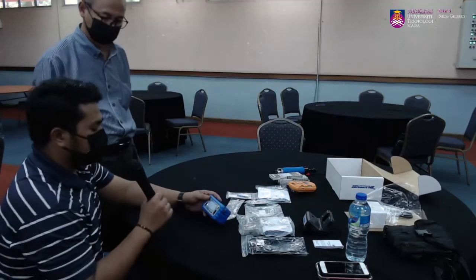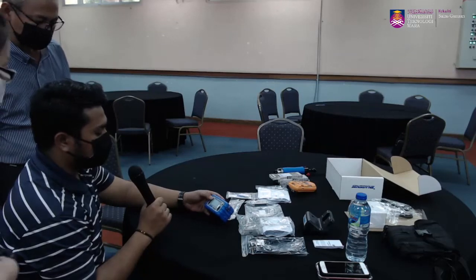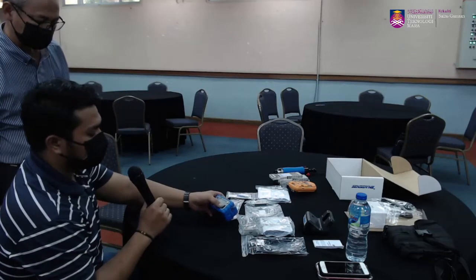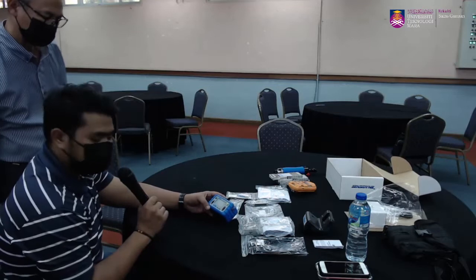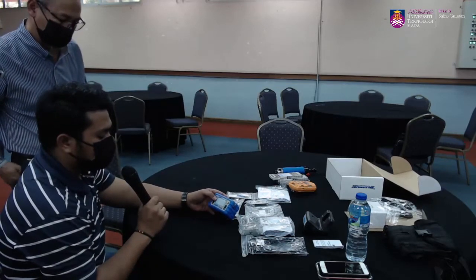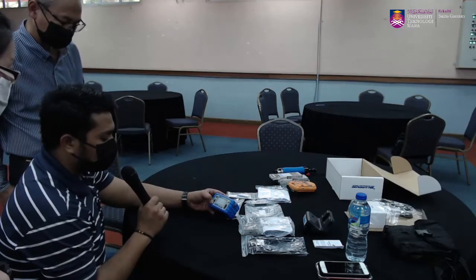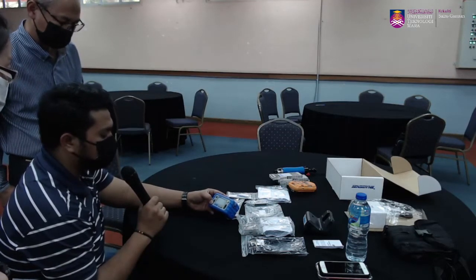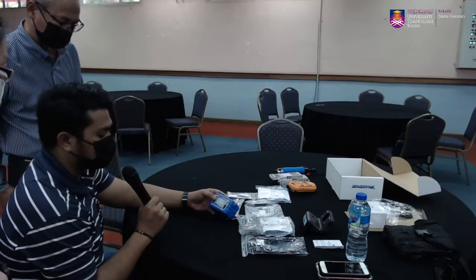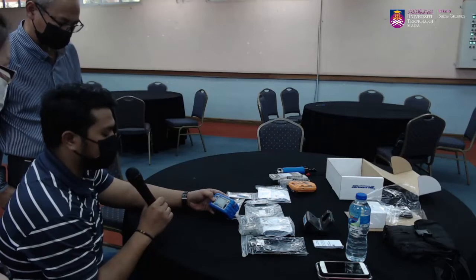Okay. So in terms of daripada physical peralatan ni, dia ada few buttons which is the back, up and down, on and off, dan kita boleh plus minus untuk adjust kita punya settings lah. So in terms of daripada sini kita boleh tengok dia ada run, flow set, calibrate, setup, control mode, run setup, review. So there's a lot of yang kita boleh buat lah in terms of maintenance pun ada. Tapi usually-nya it's daripada kita punya side lah untuk maintenance.